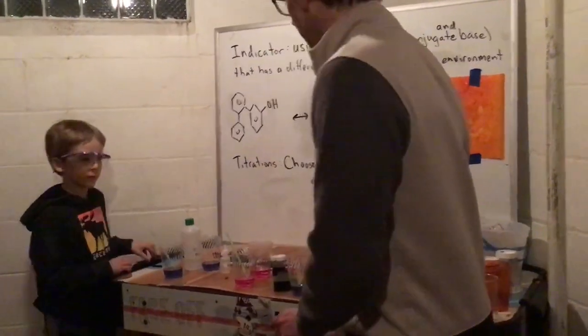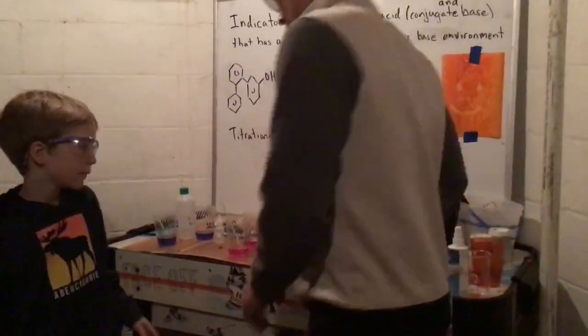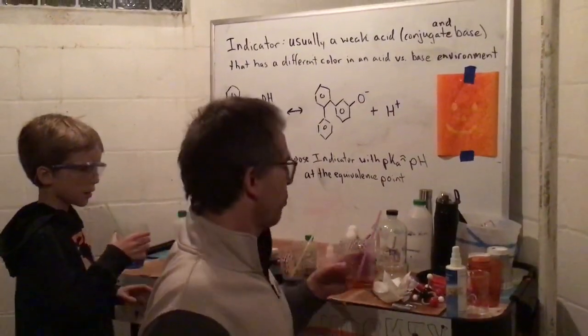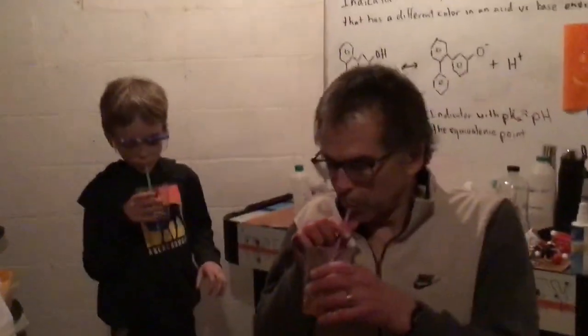Are you ready to go, Isaac? Okay, and maybe I'll get down here. You can grab your cup right there, and 3, 2, 1, we can start blowing bubbles.